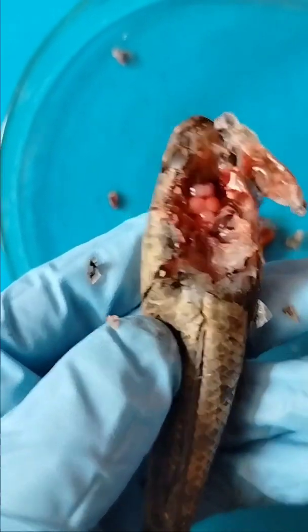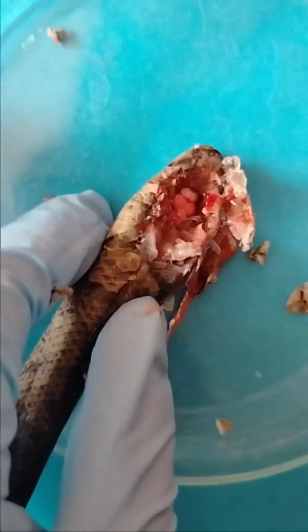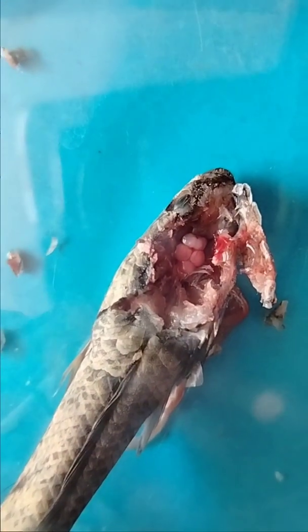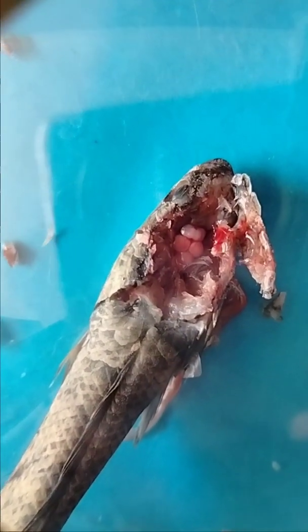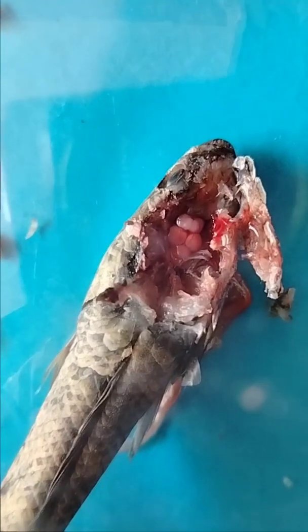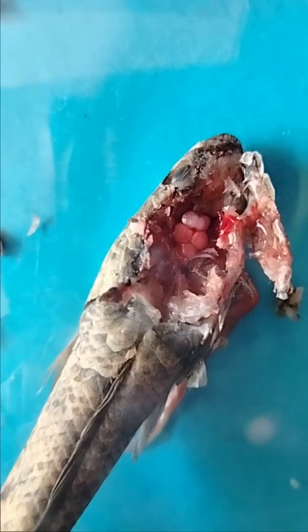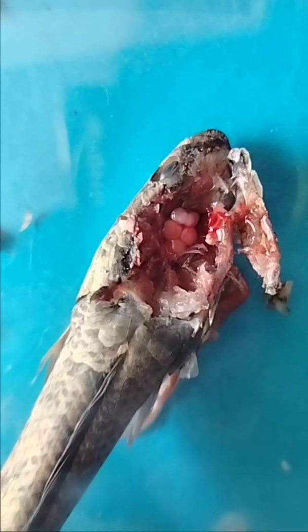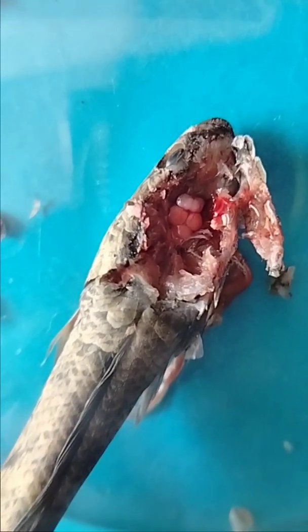On the basis of the presence of this stalk or infundibulum, pituitary glands are of two types: one is leptobasic and the other is platybasic. The medulla oblongata is characterized by large paired humps over the dorsal part. It bears 10 pairs of cranial nerves: olfactory, optic, oculomotor.